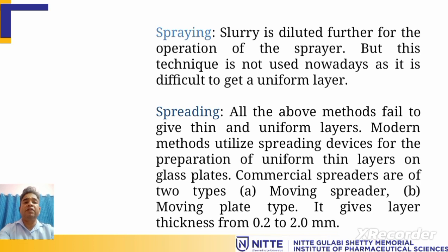The slurry is diluted further for the operation of a sprayer, but the technique is not used nowadays because of, again, the problem of getting a uniform layer for TLC. If there is no uniform layer, there will be no proper separation of a compound. So we have the other, well accepted method, which is spreading.